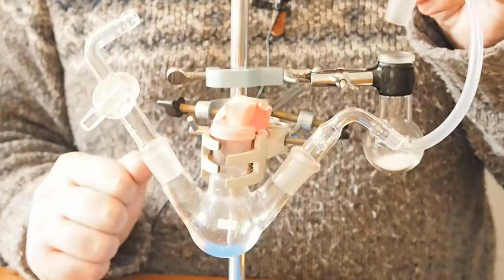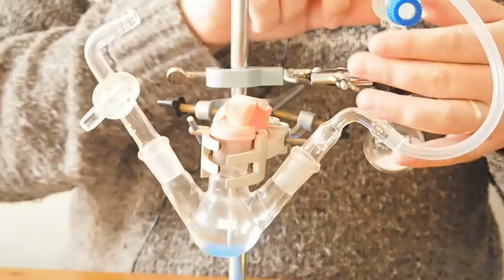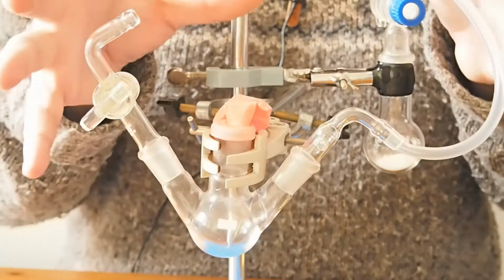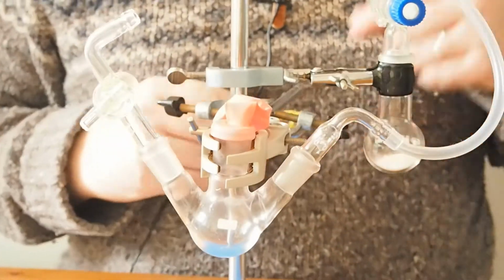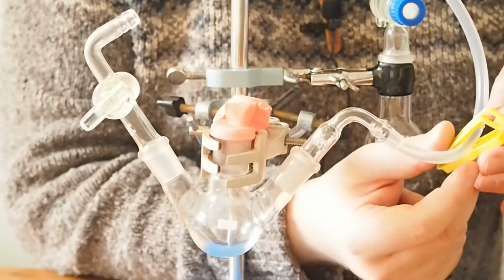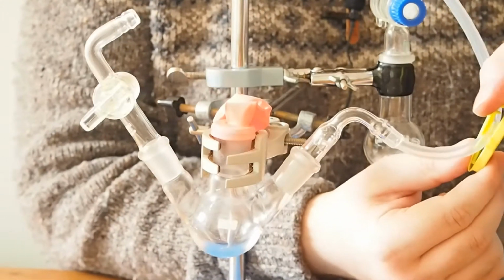Now, this is going to get attached to this back round bottom flask here, where we're going to generate the carbon dioxide. Now, I did want to originally use this tap to control the flow, so that I could switch it off and isolate the system, so that we're not losing any carbon dioxide, but it's staying under carbon dioxide. But this tap is seized really bad. I do need to fix it, but a quick fix at the minute is to just use a little kitchen clip on this plastic tube, and I close that up, and it should really reduce that flow a great deal.